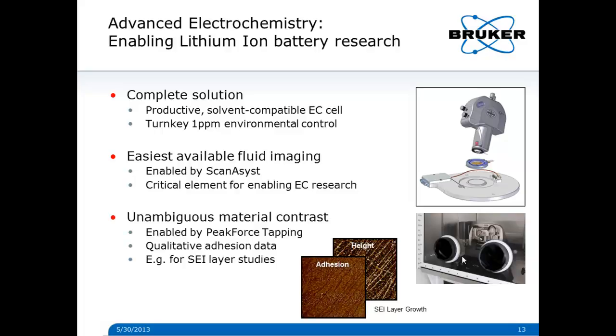But also, you get new information because now we have unambiguous material contrast, and we can really see adhesion. These images are of the SEI layer, which is a very important effect to study within lithium-ion battery research.